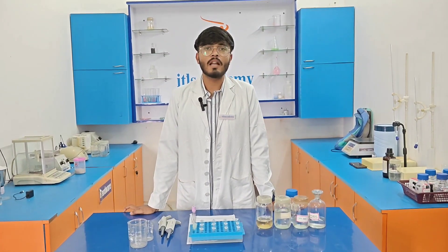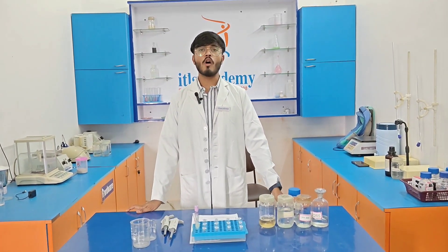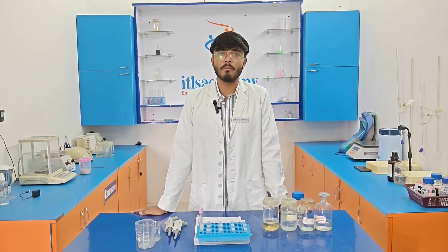Hello everyone, welcome to the Idealist Academy. Today we are going to perform isolation of DNA from a human blood sample.